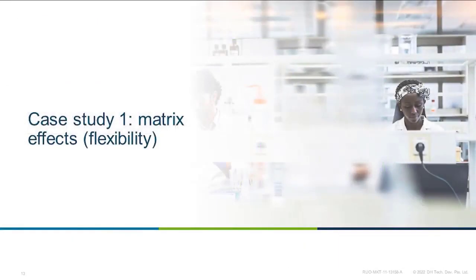Great, so let's dive into the data. First, we'll talk about the matrix effects. So this is going to really get at the flexibility of your method.